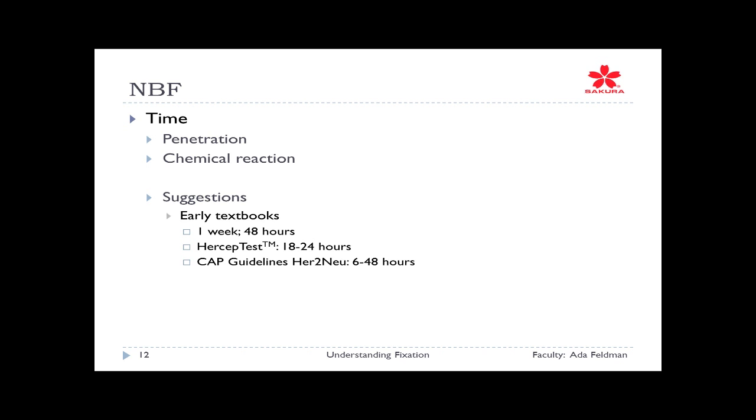Now, the early textbooks, if you go to the textbooks, you'll have some people there telling you you've got to let it fix for a week. Unheard of today. 48 hours. When I started in the field, it was not uncommon to let things sit overnight, which is not the case today. If you're doing the Herceptin test, check the package insert. They are requiring for neutral buffered formalin 18 to 24 hours.